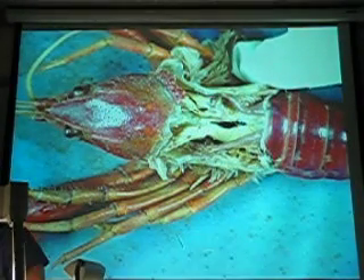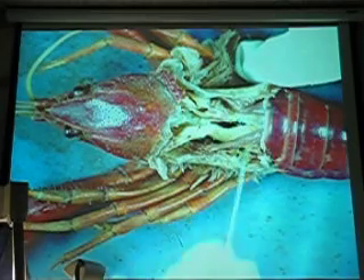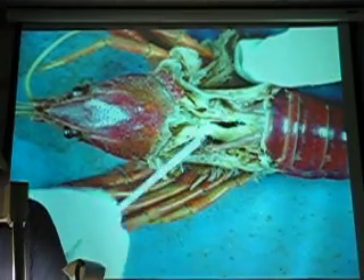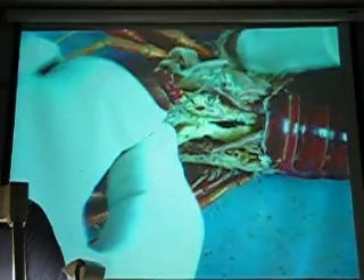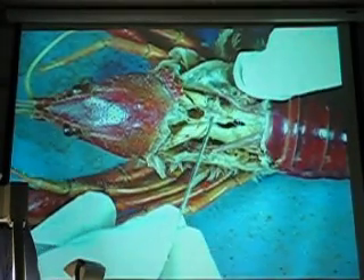Parakeet of chavis. We can see now. Good job on our legs. See this muscle? We'll do it better — actually, both of them are pretty good. What structure is it supposed to be? Oh, there it is, right here. That's the heart. That's the heart.